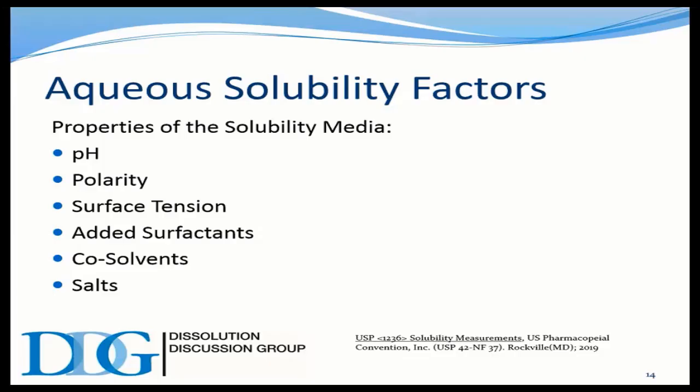And then there are salts. Sometimes the API could be remanufactured or developed to provide a way to make it more soluble. But buffer salts and things like that can be very, very helpful as well.